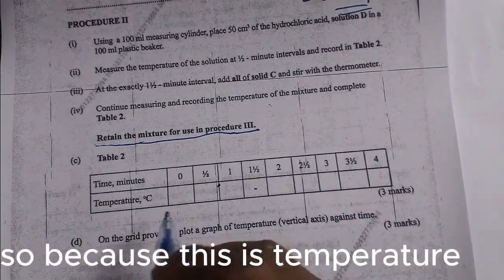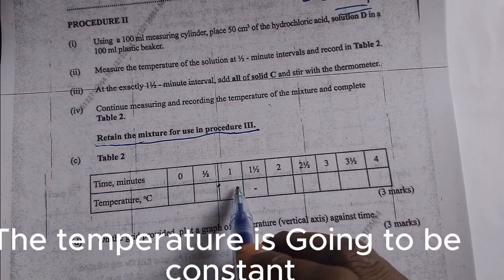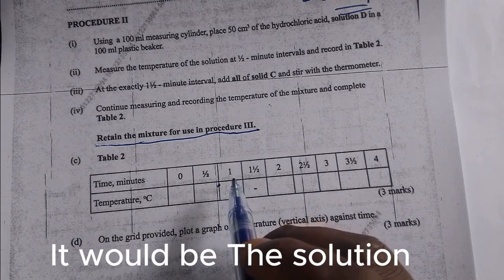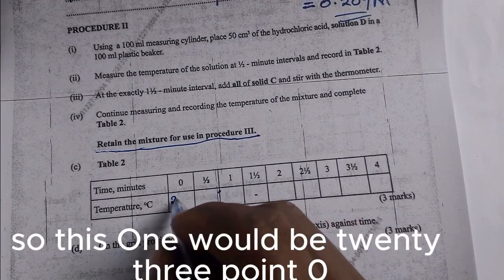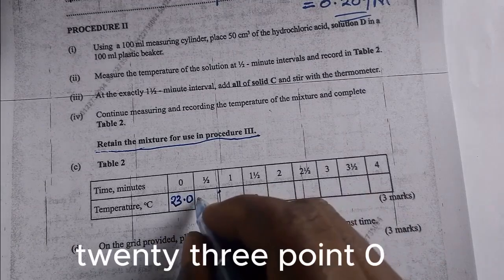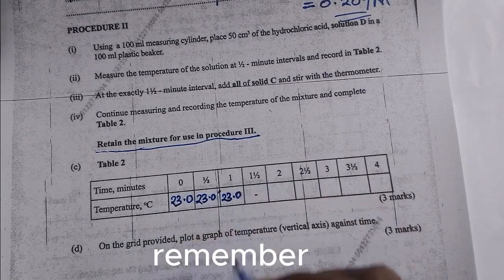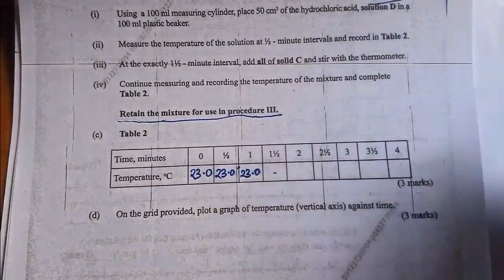Because this is temperature from 0 to 1, the temperature is going to be constant because there's nothing you have done. It will be the solution at the room temperature at that time. So this one will be 23.0, 23.0, 23.0. Remember, temperature is recorded to 1 decimal place.